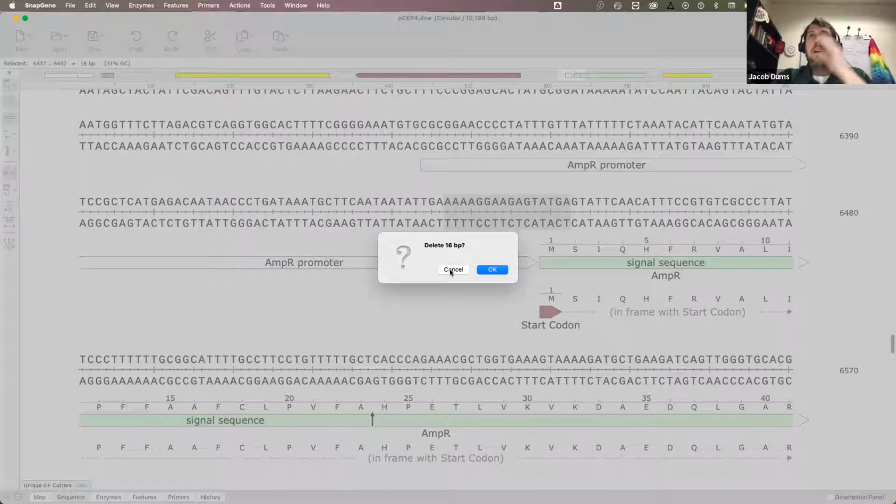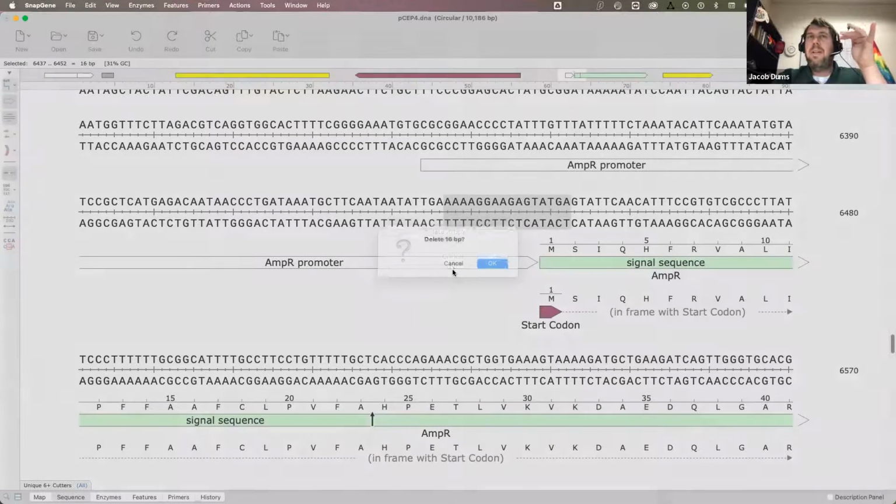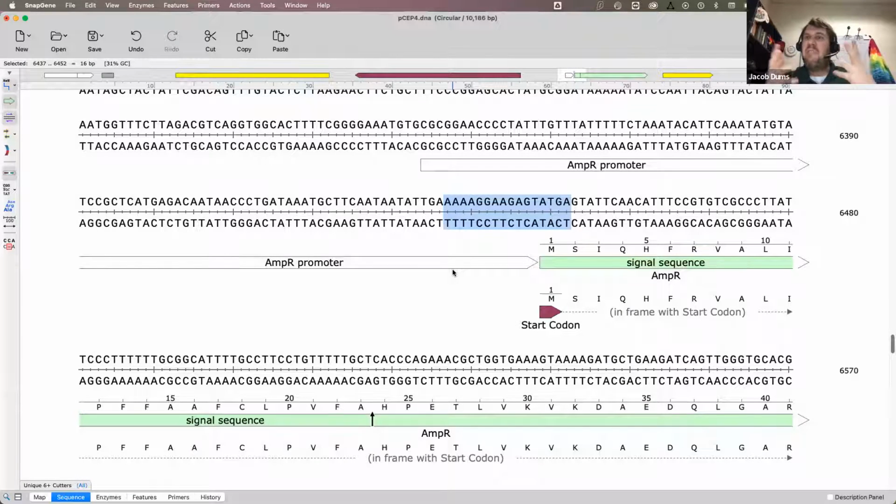But keep in mind, whenever we're manipulating DNA files and things of that sort, you have to make sure that what you're doing is something that would happen in the real world, something that you are actually capable of doing, because otherwise you're just reorganizing letters on a page.